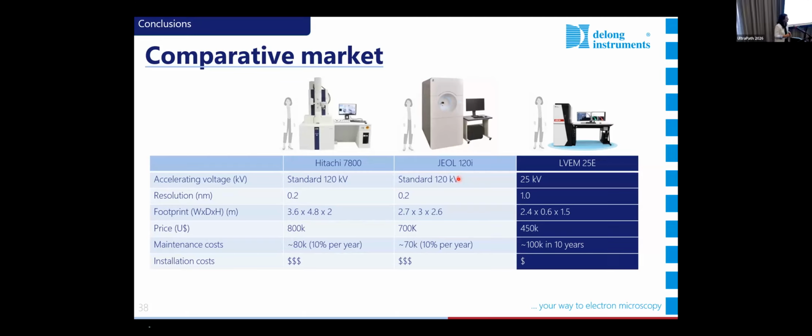So, it seems these days our main interaction with the TEMs is through the camera software. Can you talk a little bit about the camera and how the image acquisition system works, if that's something that's operable in the future? It's a little bit different than the conventional one because of the way the microscope is built. Usually we see those big towers, the columns, because the electron source is on the top and the camera is on the bottom. In this system, it's the opposite. The electrons come from the bottom to the top.